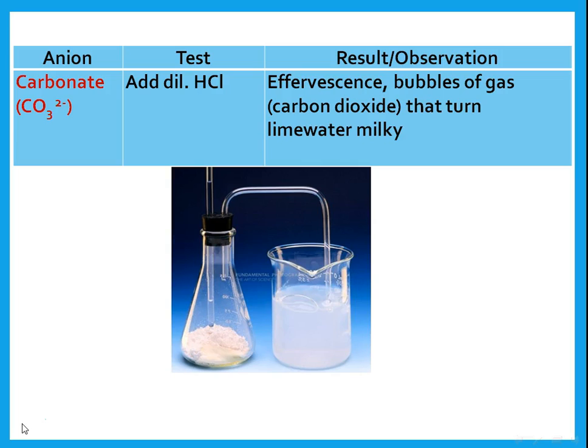So what I see or what I observe is effervescence. The word effervescence means fizzing, or it means bubbles of gas. So if effervescence is too hard to spell, you can just write bubbles of gas, but they mean the same thing. So effervescence or fizzing or bubbles of gas. And this gas is supposed to be carbon dioxide. So when I pass it through lime water, it turns the lime water milky. That's how we test for carbon dioxide gas.